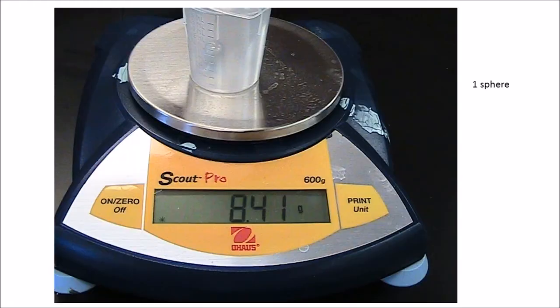So what you see here is I've got one sphere thrown in here. You can kind of see it in this window over here. It's reading a mass of about 8.41 grams. So you can record in your book that one sphere has a mass of 8.41 grams.